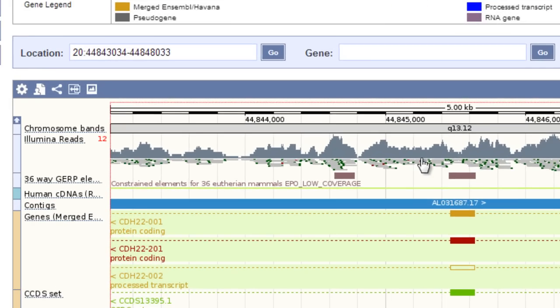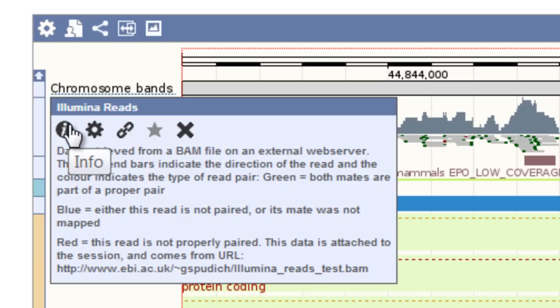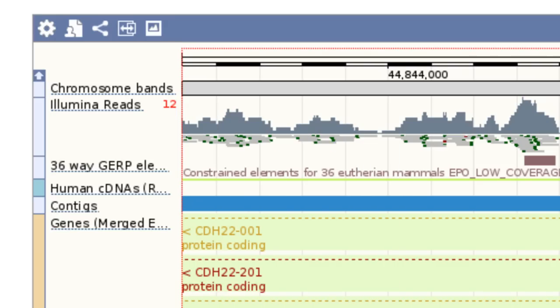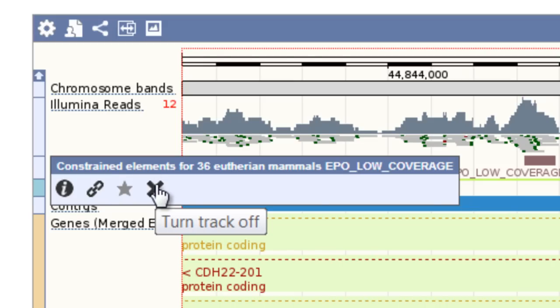If I hover over the track name and then the eye icon, I can see information. For example, the green blocks at the ends mean both reads are part of a proper pair. Did you know you can customize this view easily by turning off tracks, like this Constrained Elements track? Just hover over the track name and click the X.